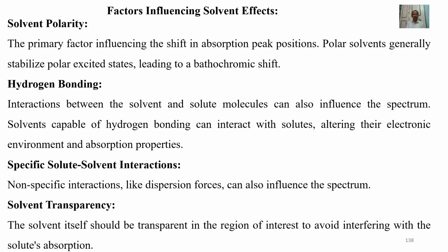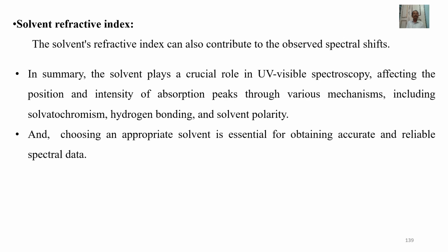Specific solute-solvent interactions. Non-specific interactions like dispersion forces can also influence the spectrum. Solvent transparency. The solvent itself should be transparent in the region of interest to avoid interfering with the solute's absorption. Solvent refractive index. The solvent's refractive index can also contribute to the observed spectral shifts.